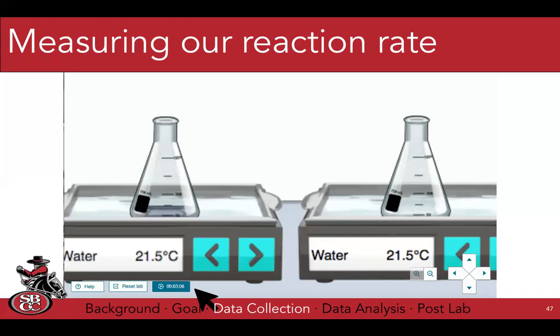But you're right, the temperature is really important in kinetics. That's why we're keeping both of our starting flasks A and B at 21.5, and we're keeping our reaction as it goes at 21.5. So the temperature is constant, and that shouldn't affect the rate. Normally we would have a thermometer in here, but we're just going to assume it works perfectly.